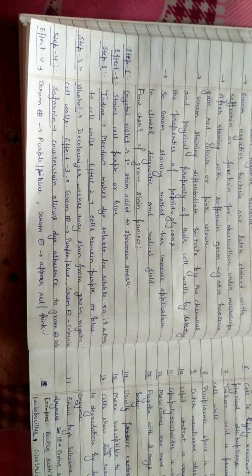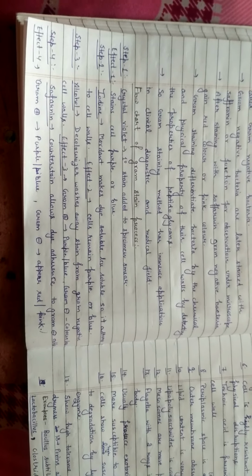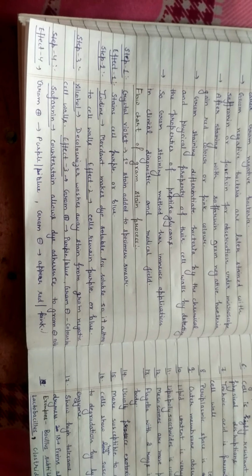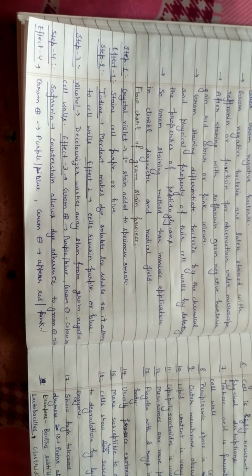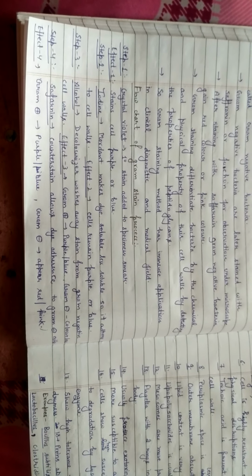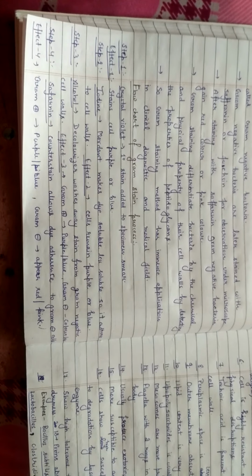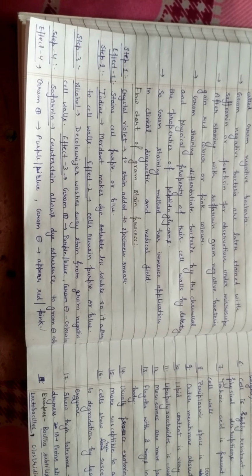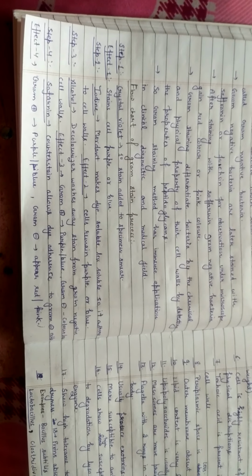So the crystal violet dye adheres to the cell wall because it is less soluble now. Again, both gram-positive and gram-negative bacteria remain purplish or bluish in color. The iodine solution is also called Lugol solution.